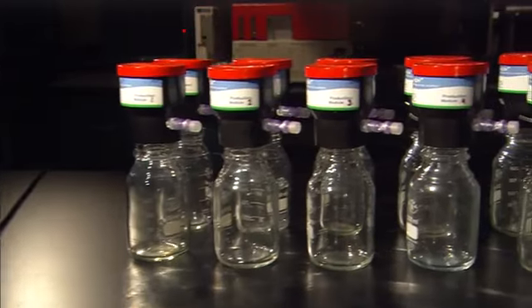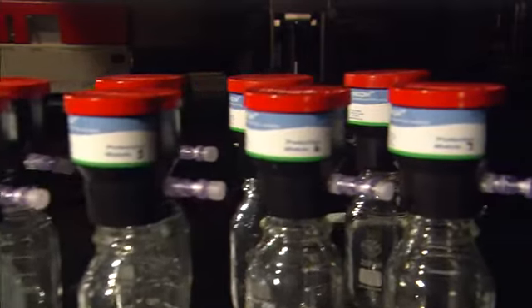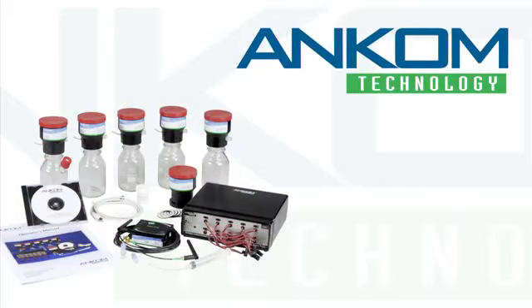The ANKOM RF gas production system is a precise and accurate tool that can help meet your research and testing needs. We hope you have benefited from this brief overview and welcome any questions you may have.